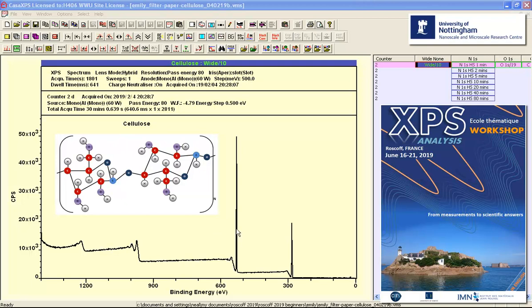This is the oxygen 1S, this is the carbon 1S and the amount of carbon and oxygen in this sample is significant enough that we can see these peaks very clearly. However there is a suspicion that the sample may also contain nitrogen and what we would like to do is work out whether this measurement was sufficient to identify the existence of nitrogen in the sample or not.